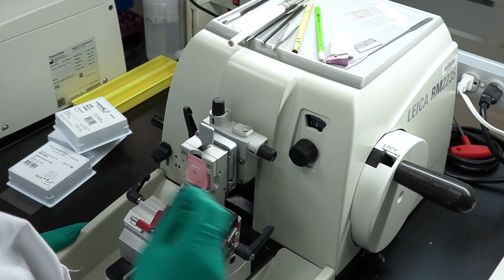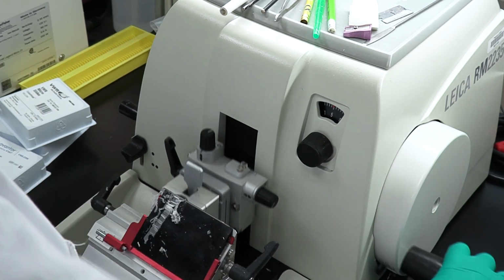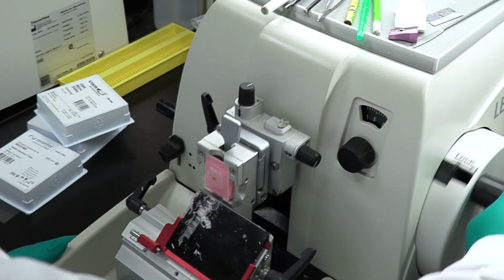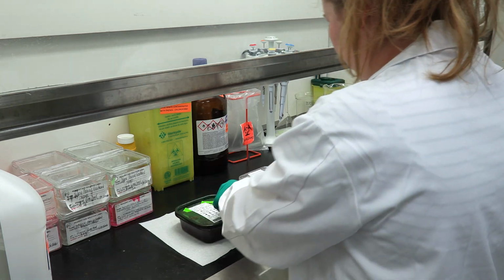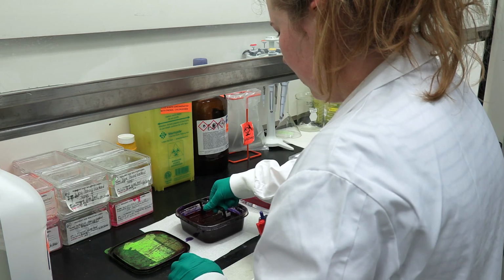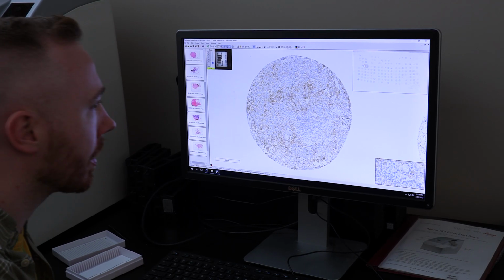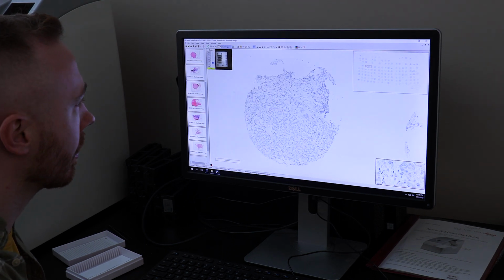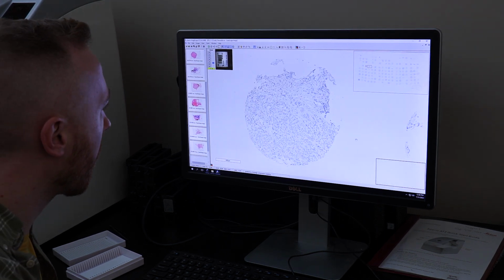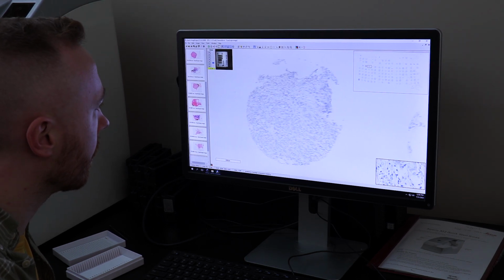Before we can begin the proposed experiments, we need to make sure that the sample contains sufficient tumor material for the project. To do this, we need to visualize the tissue by shaving off a very thin section of the tissue and transferring it to a microscope slide. To visualize the tissue and the tissue structure, the tissue is stained with two dyes. We can then visualize the tissue either directly by the microscope or by taking images of the slides and visualizing them on a screen. Once we've identified where the tumor cells are and how much there is, we can begin the experiments associated with the project.